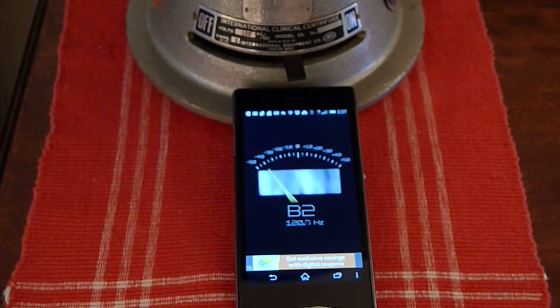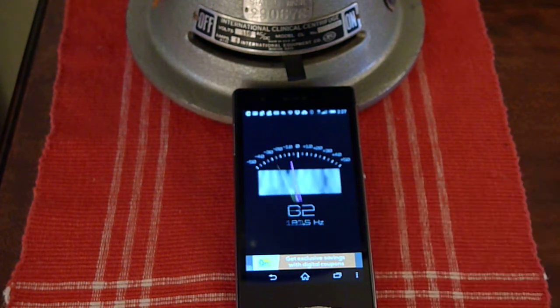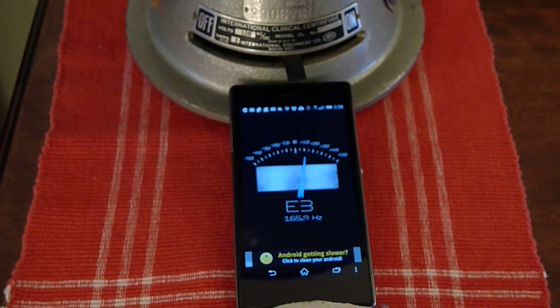Now when you first start it up, it'll give you some weird number. You've got to get it up past 16 Hz. It just kicked in — 19 Hz, 20 Hz. Well, those aren't RPMs, those are RPSs — revolutions per second.